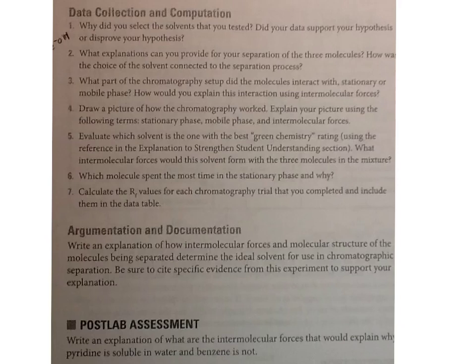Okay, so we're looking at the sticky situation lab, and I'm going to go through a couple of the questions. I'm going to show you how some of the molecules are going to bond with water and some other things that came from your pre-lab questions part of it. And then we'll go through most of the questions.